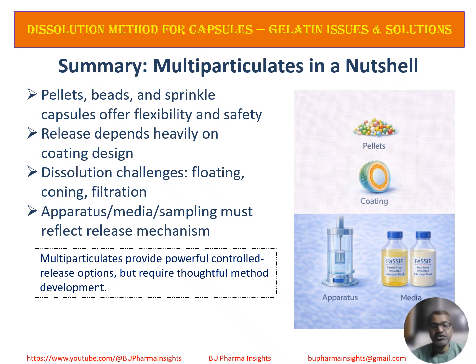Common challenges include floating, coning, and filtration issues. Your apparatus, media, and sampling strategy must always match the release mechanism. When tested correctly, multiparticulates deliver reliable, predictable, and patient-friendly therapy. Modern formulations are moving towards multiparticulates, and so should our dissolution strategies.